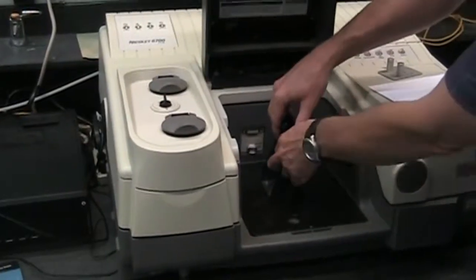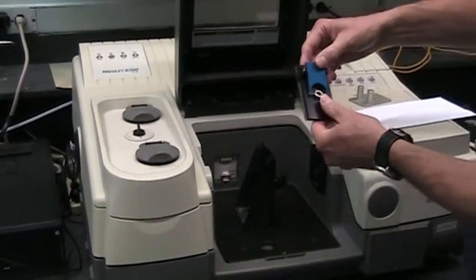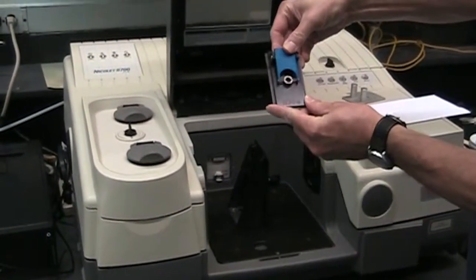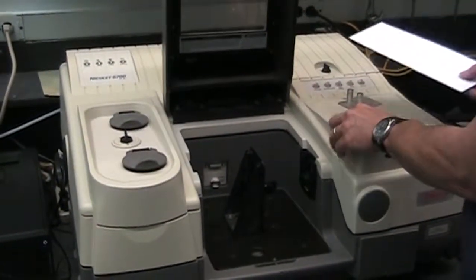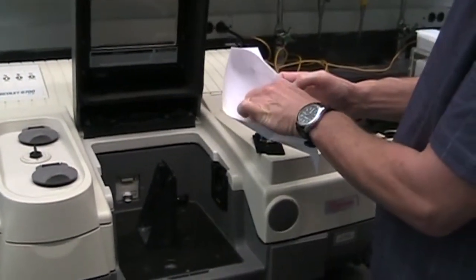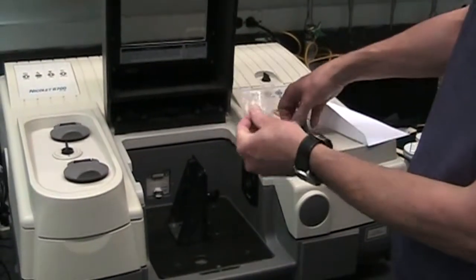So with this sample holder in place, there's a variety of options. This holder here is pretty versatile, so we can use this for a number of different things. You can see it's got just a little spring action. And what I'll show you here is how to run a polymer sample, just a piece of film of some type. Piece of plastic bag, it seems like.